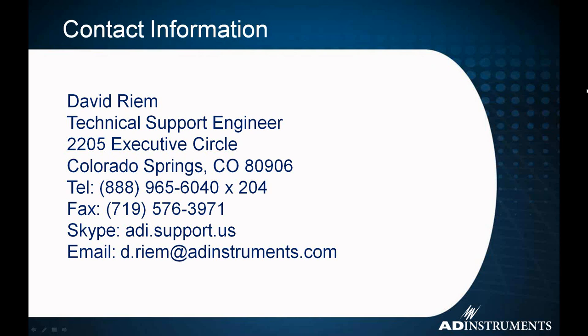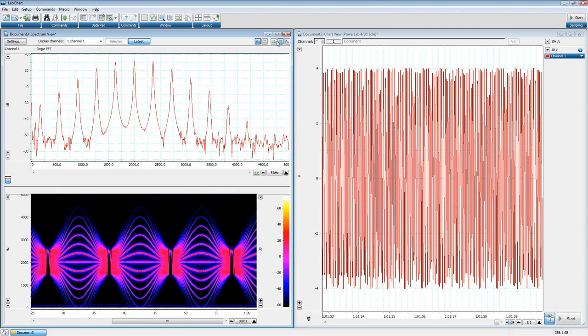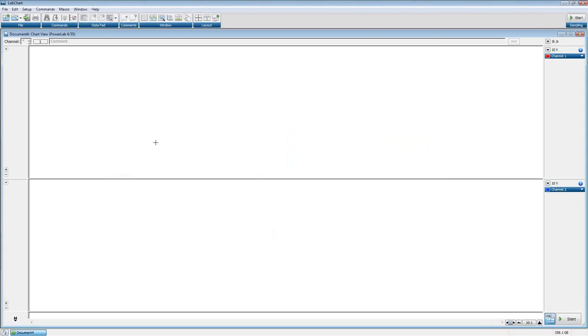It looks like we do have a few. We have one question. Let me drag this out here so we can see. So is there a provision for setting train? So train frequency, train duration? Most definitely. You probably kind of maybe saw that when I was putting things together here. So if by train you mean a specific segment, we can definitely change that within.